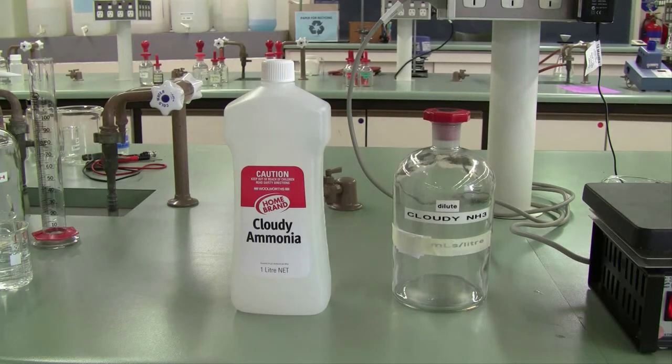Regarding your pH titration, it is a titration, a chemical reaction, where you had a known substance, your acid, and an unknown substance, your base. Stoichiometry should therefore yield a lot more information about your unknown substance, your cloudy ammonia solution. Again, do make sure that you've noted down the dilution factor that tells you how we prepared the dilute ammonia solution for you.